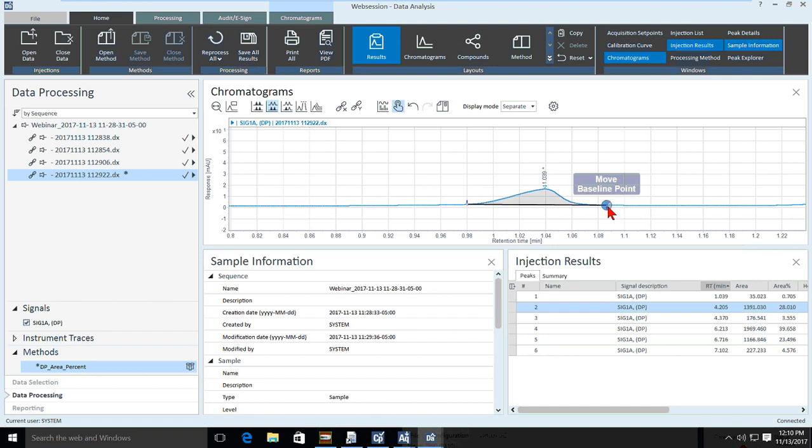So here's the interactive mouse. When I highlight over the end of it, it assumes I want to modify this integration event that's already been established. So I can take it and move it. I can shift it back. I can end it up here if I need to. So that's the interactive mouse. All right, so let me zoom out and look at.